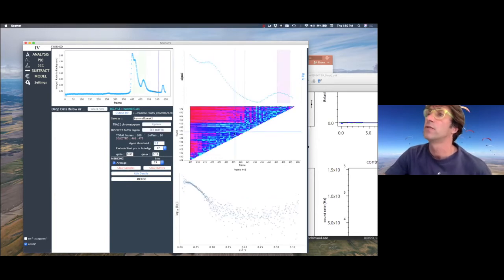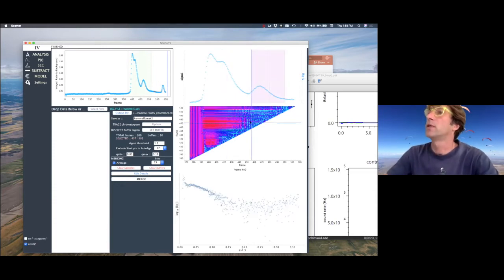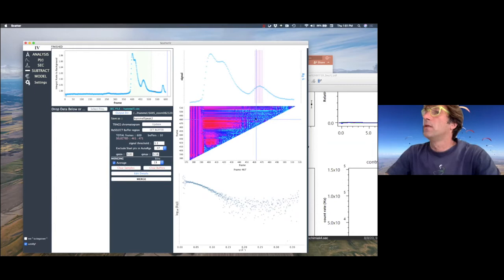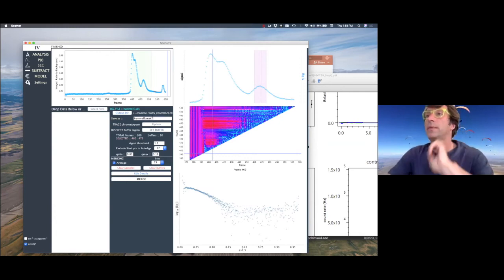There are other tools that can be used, but I will not go there today. Maybe tomorrow we can manage that. Okay, so now you see a little bit less of the problem of the capillary fouling, and we can call it peak 3.